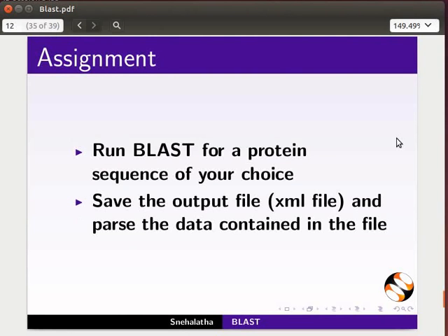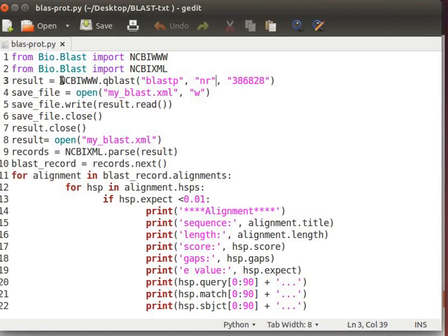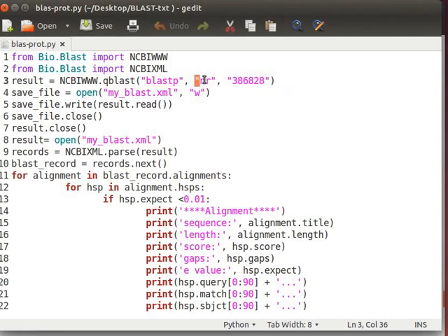Your completed assignment should have the following lines of code as shown in this file. Since our query is a protein sequence, we have used the BLASTP program and NR, that is the non-redundant protein database, for the BLAST search.